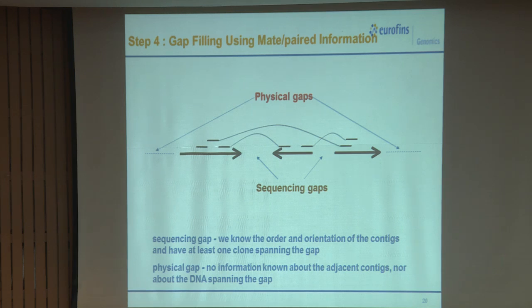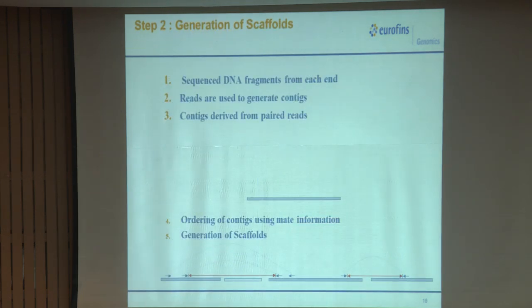Within the scaffold, you can use an insert sequence for gap filling. If the contigs are placed and there is a gap in between, you can fill up the gap within the scaffold. Between two scaffolds we cannot, but we also have a super scaffold.